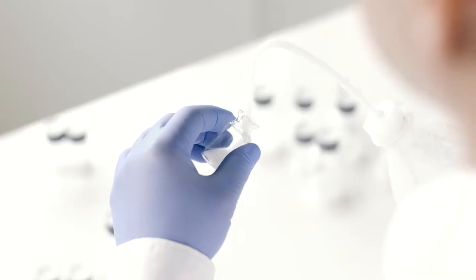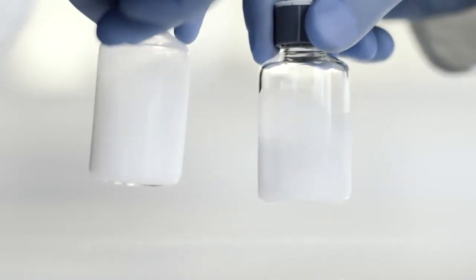One property, for example, is the barrier between the drug on the one hand side and the inner surface of the vial to avoid ion interaction of both.